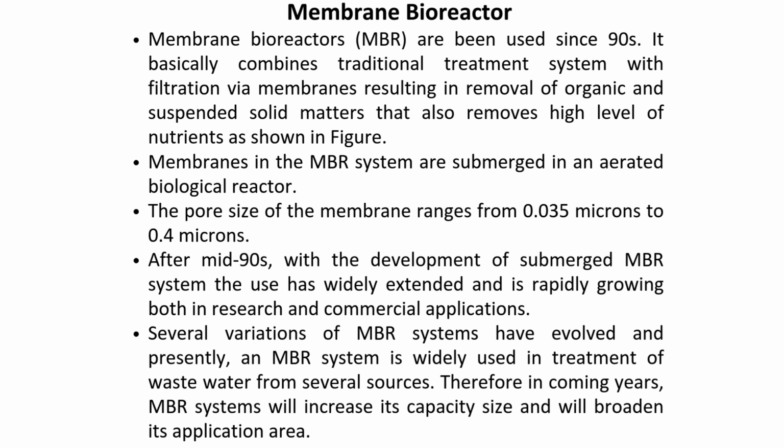After the mid-1990s, with the development of the submerged MBR system, their use expanded widely and continues to grow rapidly in both research and commercial applications. Several variations of MBR systems have evolved, and they are now widely used for treating wastewater from various sources. In the coming years, it is expected that MBR systems will increase in capacity and broaden their application area.